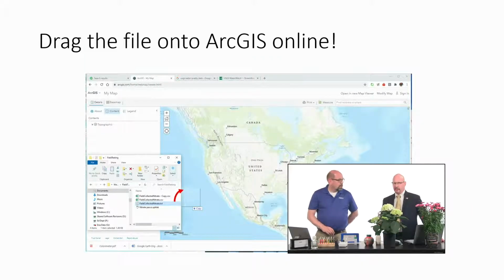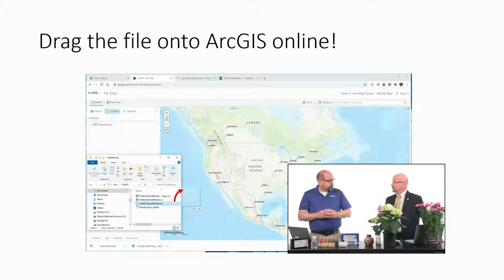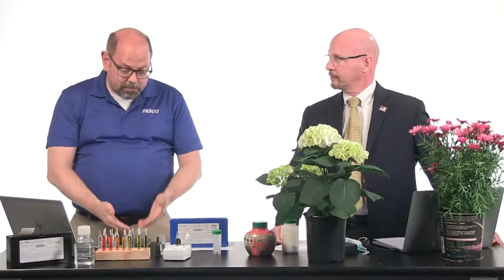And when it exports it, it's giving the data in a standard file format, correct? It's CSV, right? Comma separated values. Right. It'll be a table saying, here's your latitude, here's your longitude, here's what the nitrate value was, and any other instrument that you were hooked up to on your phone, whether that was any of those probes we talked about at the beginning, is taking the GPS and marrying those together. So now they're a single file.